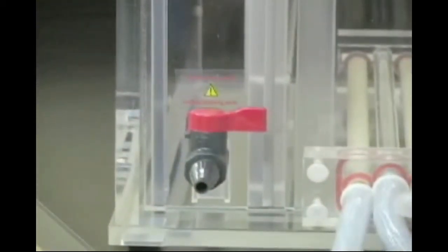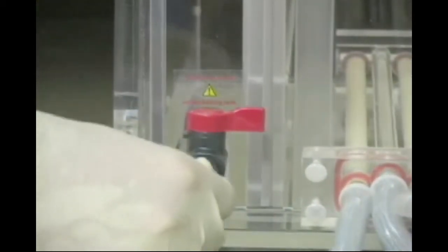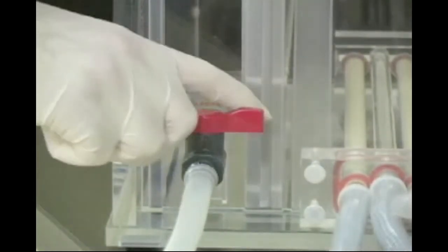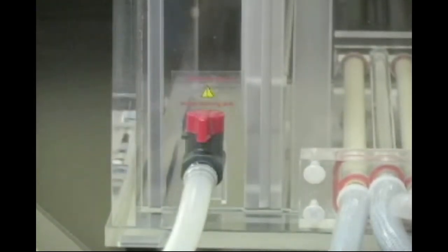The Protean Plus DodecaCell has a drain port that allows quick and easy drainage of buffer. Simply attach the provided extension tubing to the drain port and place a receiving vessel below the cell to catch the buffer. Open the valve when you are ready to drain the buffer.